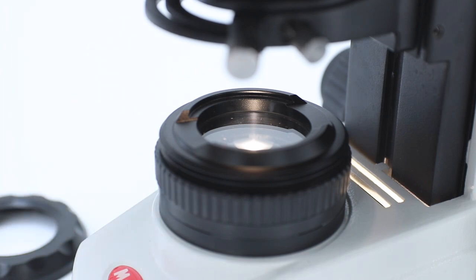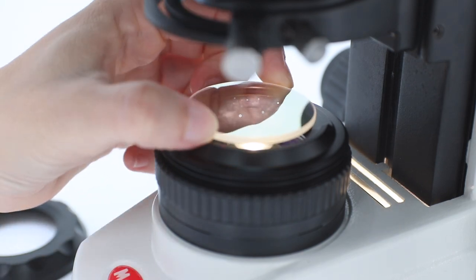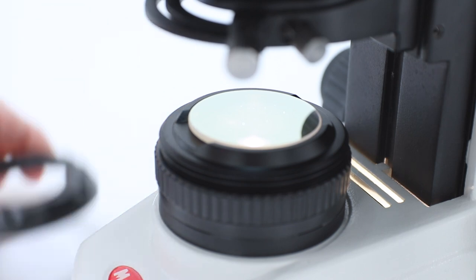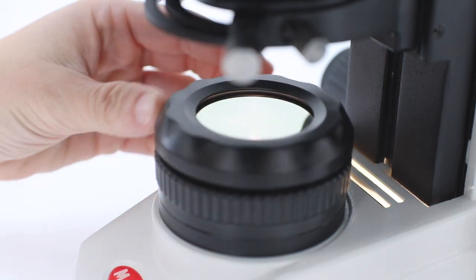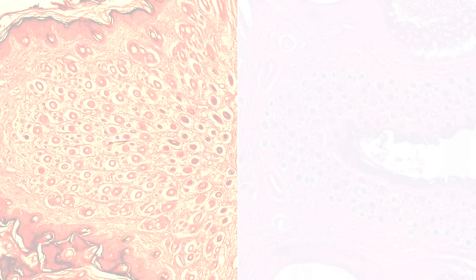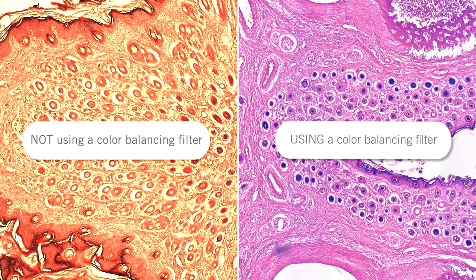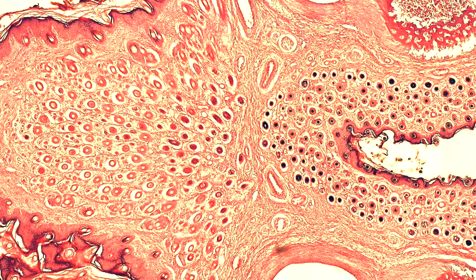This corrects the color temperature so that the yellow light projected from the tungsten or halogen bulb becomes white. Microscopes with LED illumination sources generally do not need this filter because the color temperature is already sufficiently high.